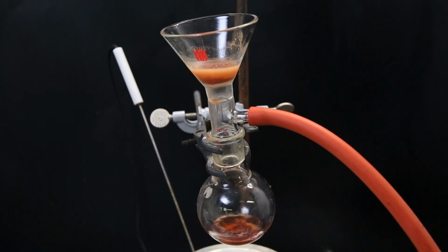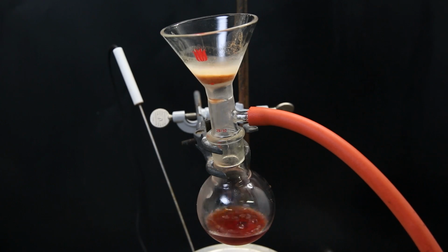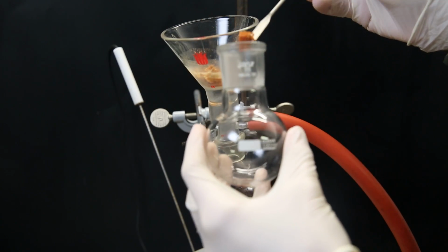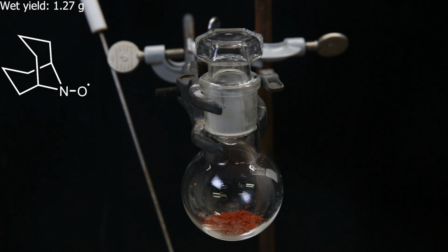I quickly filter the mixture through a glass-fritted funnel and collect the solid. I wash the flask once with some heptane and then take the solid residue and put it in a new flask. After scraping out as much as I could, I recovered 1.27 grams of a wet ABNO.